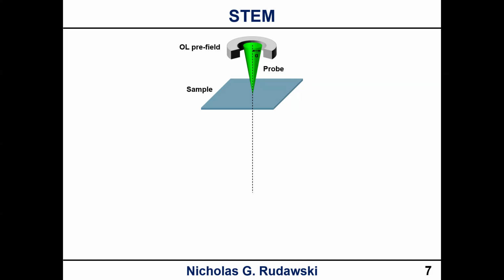So that's where sometimes you need additional tools to help you make sense of what you're seeing. Generally speaking, though, if we're talking about atomic-level detail, it's usually pretty obvious when you're focused right on the surface, because you're going to see the sharpest contrast, especially with HAADF-STEM, because you don't have the issue of contrast reversals with the focal state.